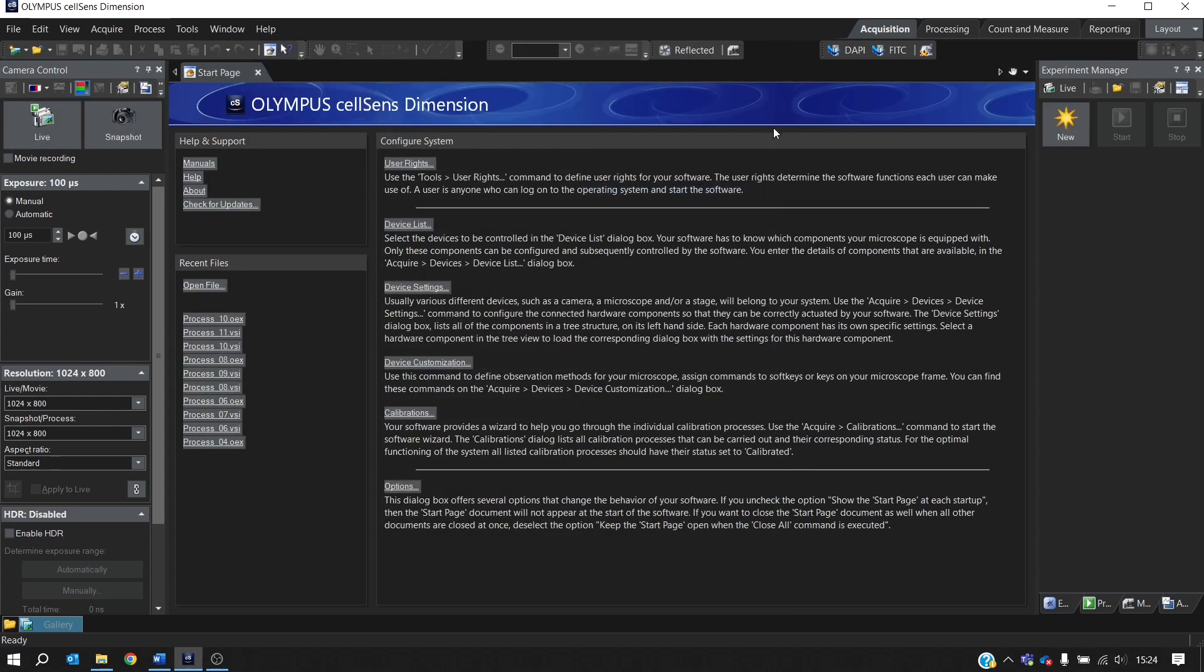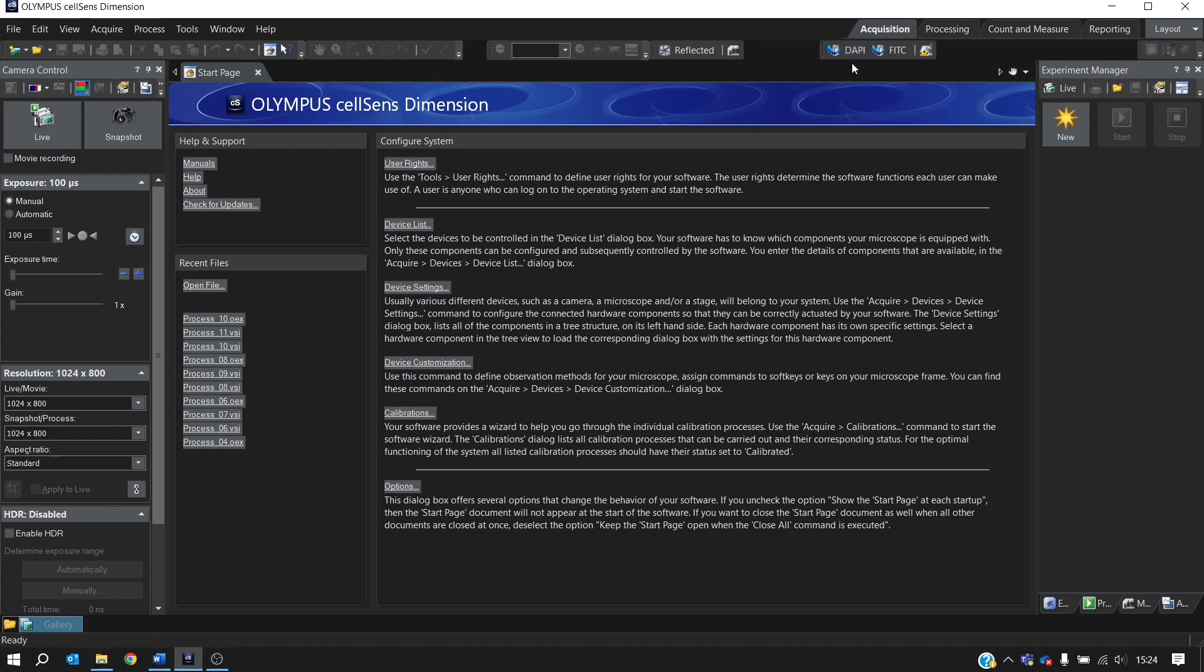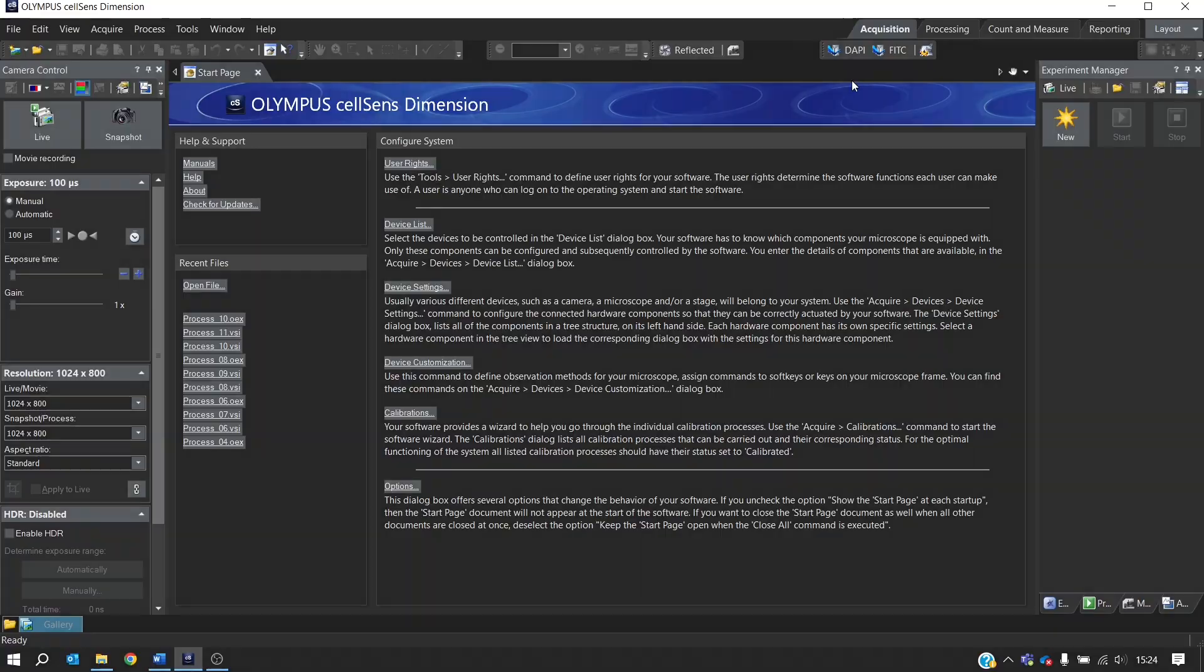And here you can see that the two observation methods are now available from the toolbar. But of course, if we select them, the LEDs won't switch on because they'll only switch on when the camera is acquiring the image.